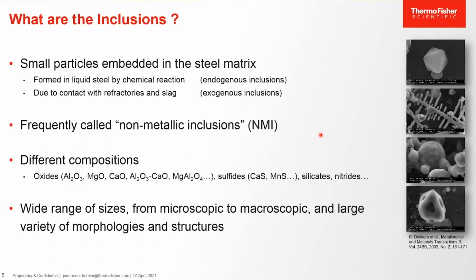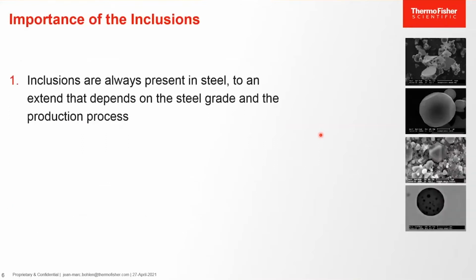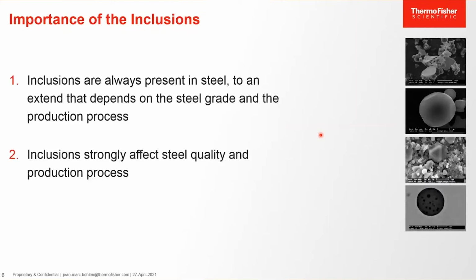process. The importance of the inclusions is due to several things. First, the inclusions are always present in steel. Their extent depends on the steel grade and on the production process. Second, the inclusions strongly affect the steel quality and the production process.